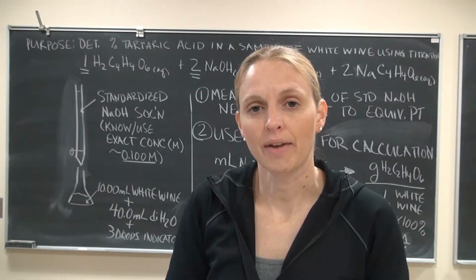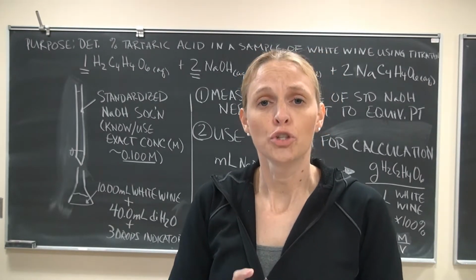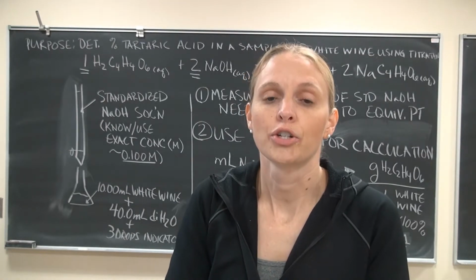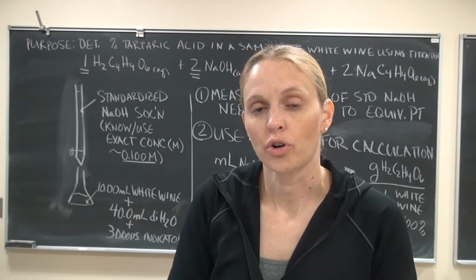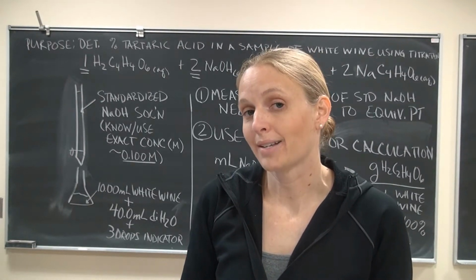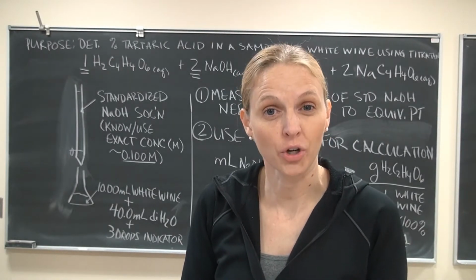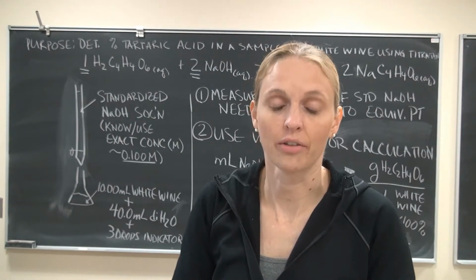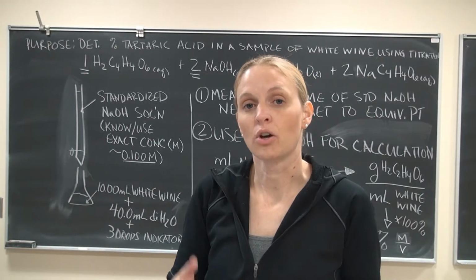There's a couple different types of acids in white wine or in any wine, two of them being the highest components: tartaric acid and malic acid, and tartaric acid being the larger of those two. So we're going to assume that all of the acid that we're measuring in our sample is coming from tartaric acid, even though it really isn't. There's other acids in the wine as well.